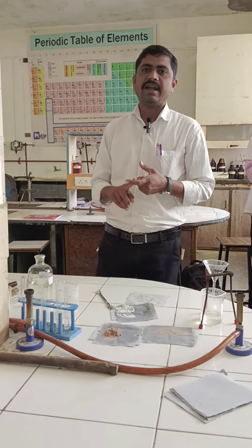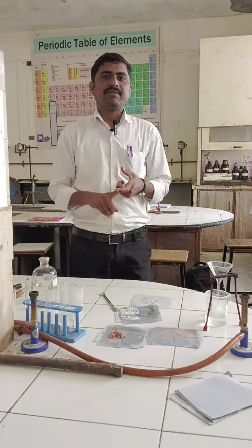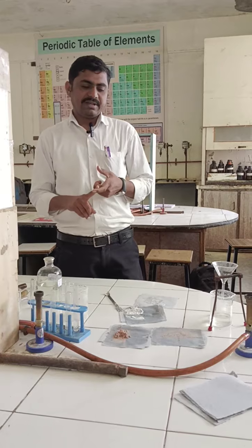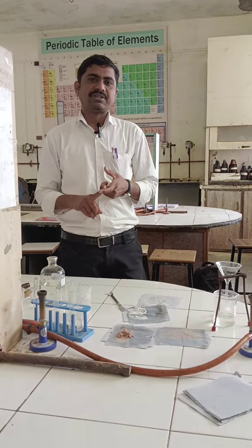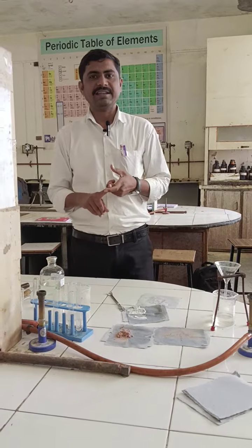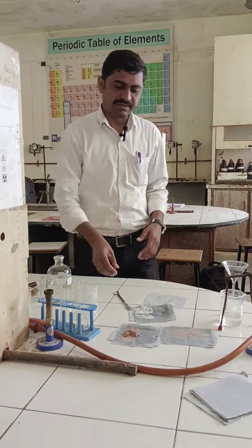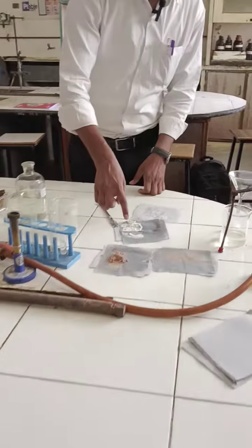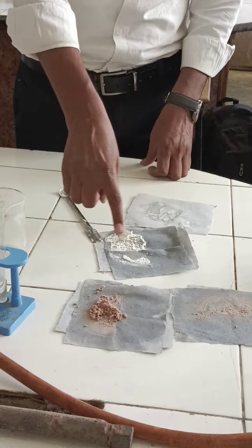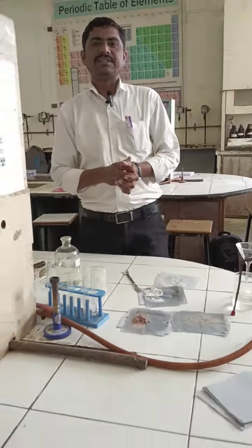Next we added sodium bicarbonate solution and got effervescence of carbon dioxide, CO2, so one compound is soluble in sodium bicarbonate, which is acidic in nature. After filtration we get the residue, and to the filtrate we added dilute hydrochloric acid, and then we get the acidic compound. So this is all about today's session. Thank you.